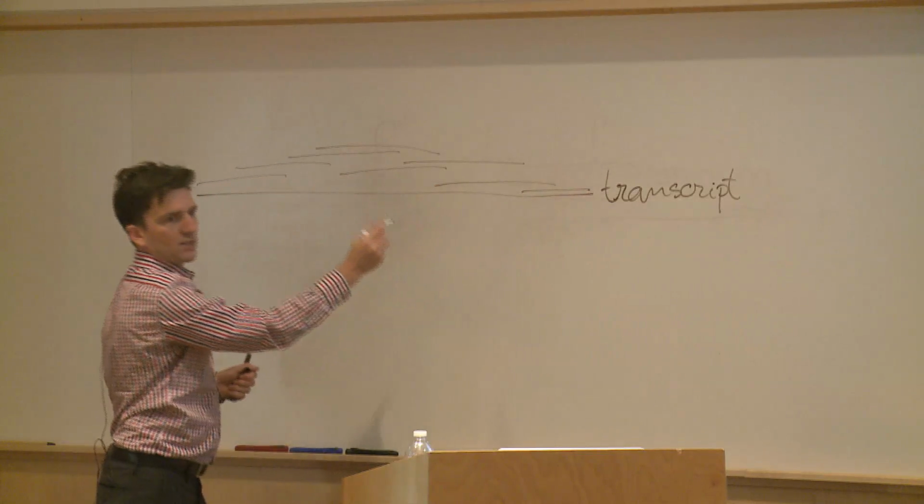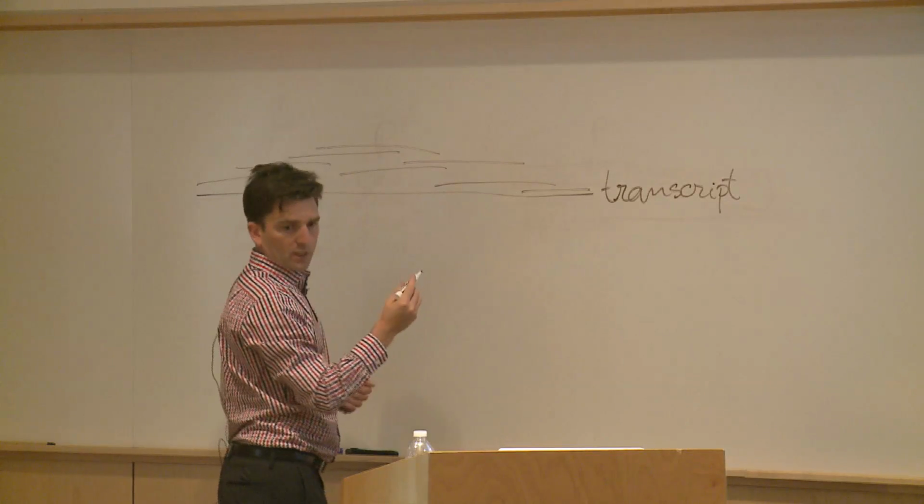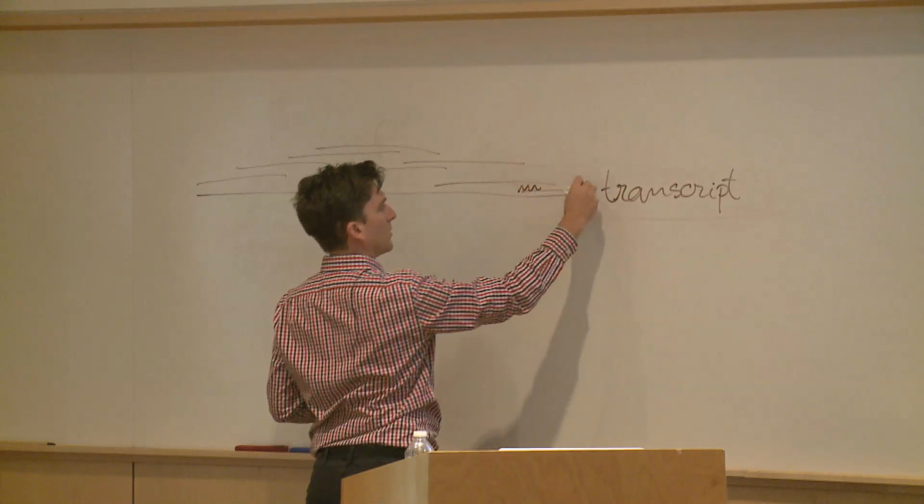Okay, and so that's the fragment. So we fragmented the transcript into those things, and we're going to sequence the, I don't have another color, but that's fine. What we're going to sequence is here.